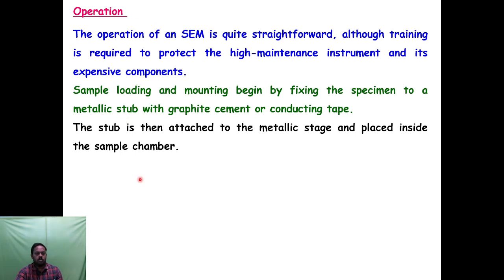So far I discussed what components are present in the SEM microscope and what the different roles of those components are. The important components are the electron gun and lenses, condenser lens and objective lens, detectors and specimen current, and the image production, the reconstructed image on the CRT screen. So these are the major components present in the scanning electron microscope.